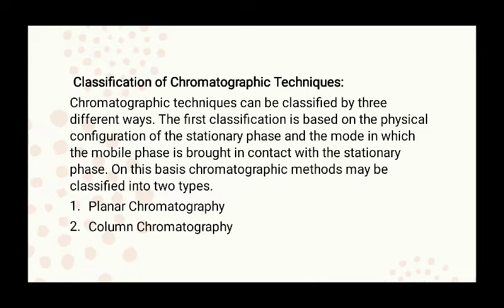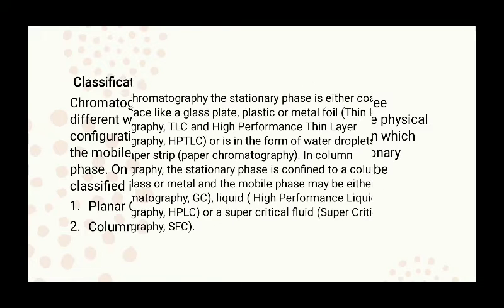Chromatography techniques can be classified in three different ways. The first classification is based on the physical configuration of the stationary phase and the mode in which the mobile phase is brought in contact with the stationary phase. On this basis, chromatographic methods may be classified into two types: planar chromatography and column chromatography.